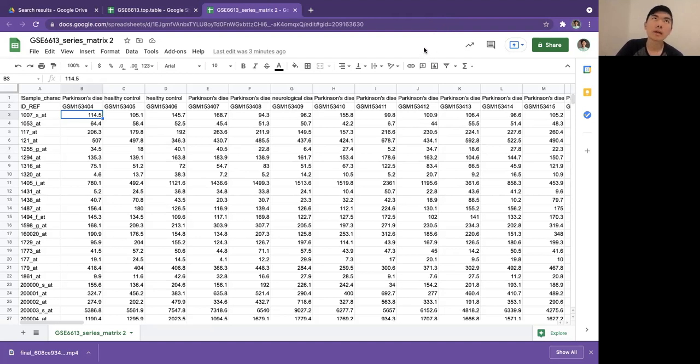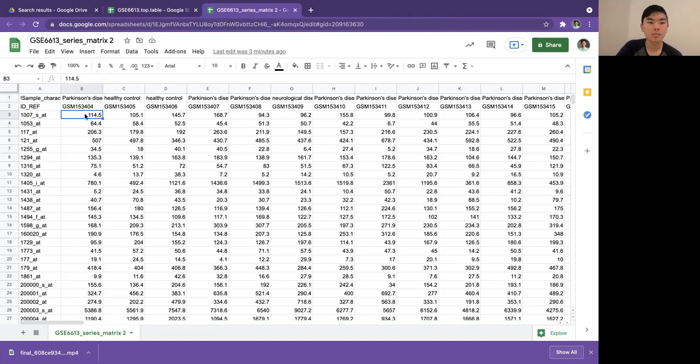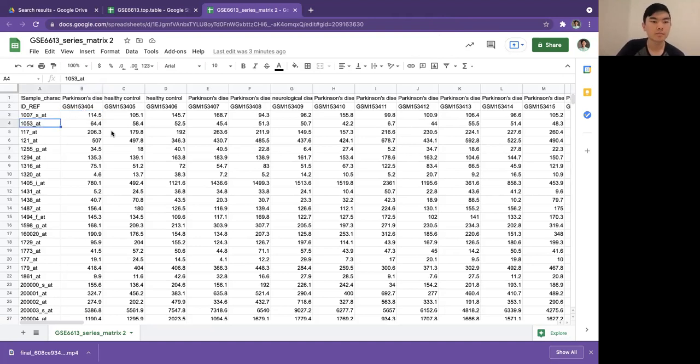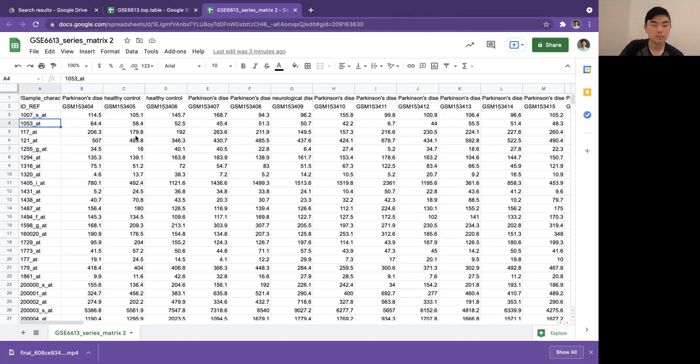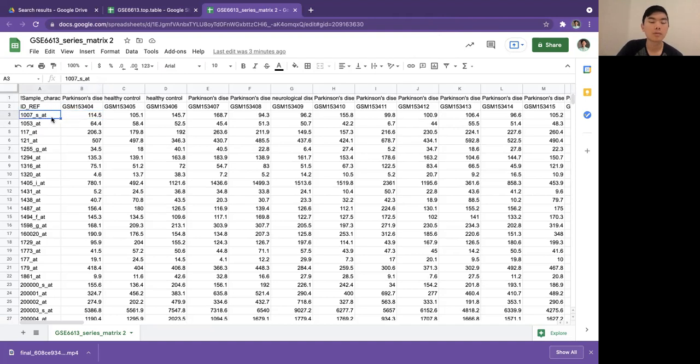Just know that this number is not like 100 or 114.5 mRNA molecules in this gene. It's like a signal intensity of how the laser interacted with the probe for that patient. Generally, the higher the number, the greater the expression, and reverse for lower numbers.